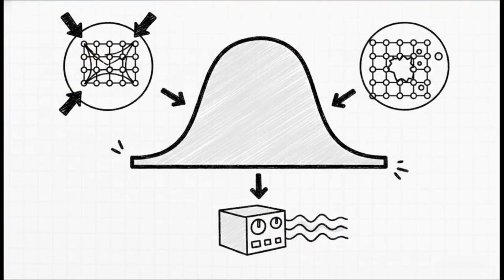Okay, time for a little bit of a plot twist. It turns out small crystallite size is not the only thing that can cause an XRD peak to get wider. The Scherrer equation basically assumes that the sole reason your peak is wide is because your crystallites are tiny, like under 100 nanometers tiny. But in the real world, your observed peak width is actually a mix of size broadening, strain broadening, and even instrumental broadening.